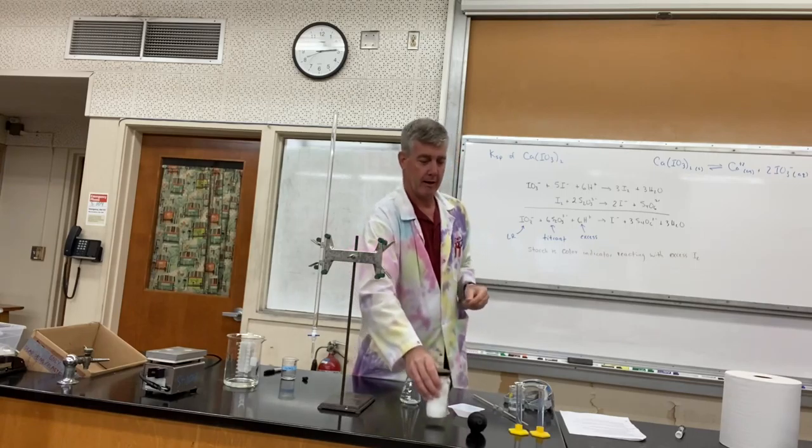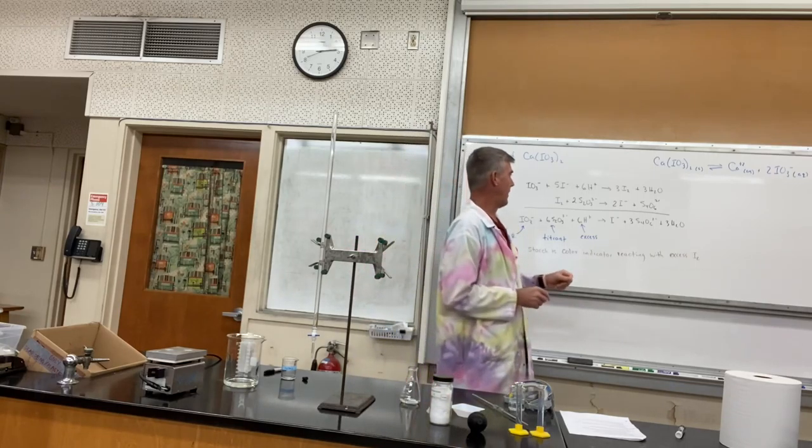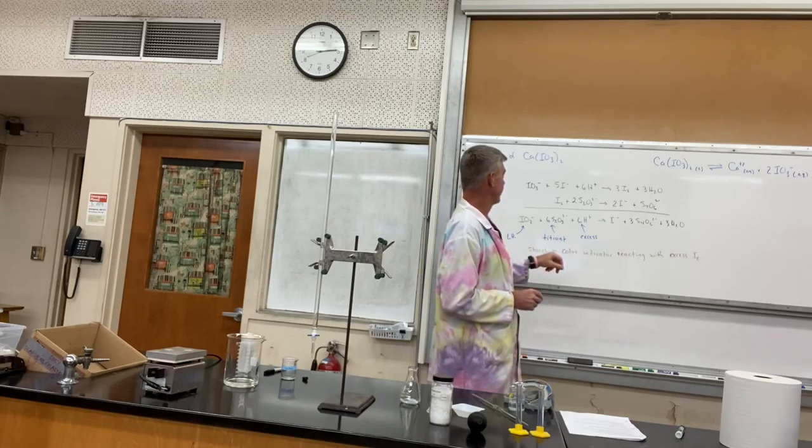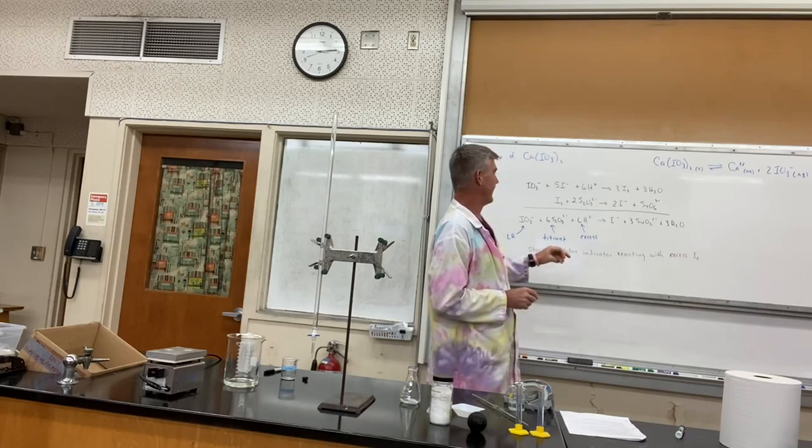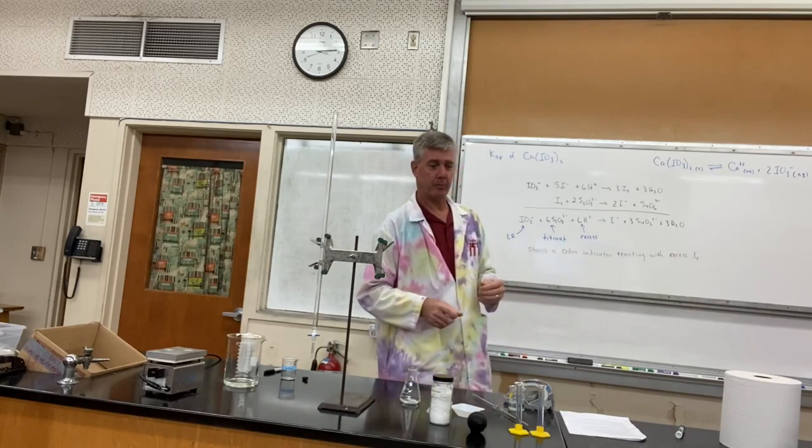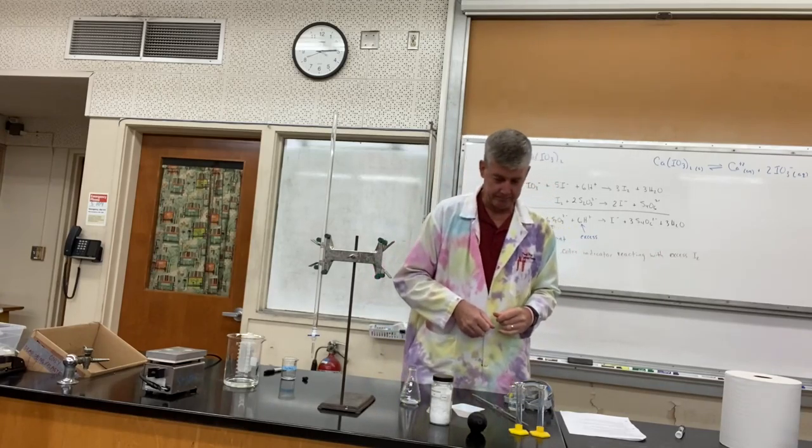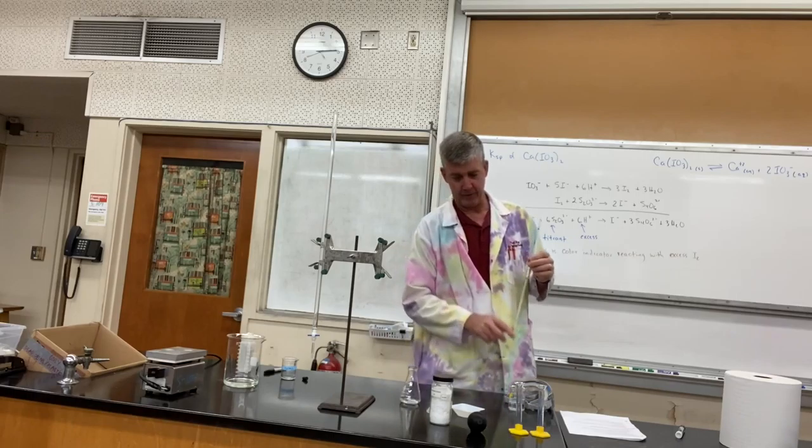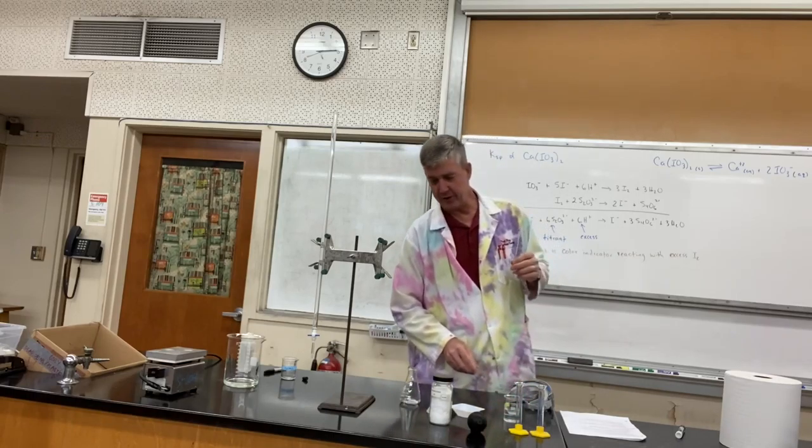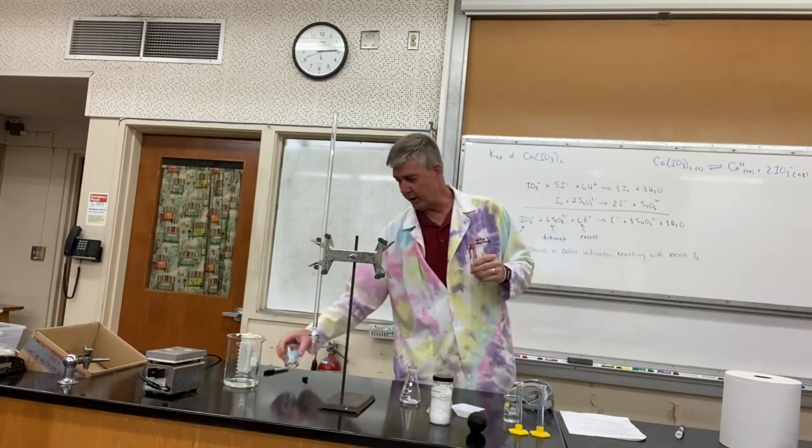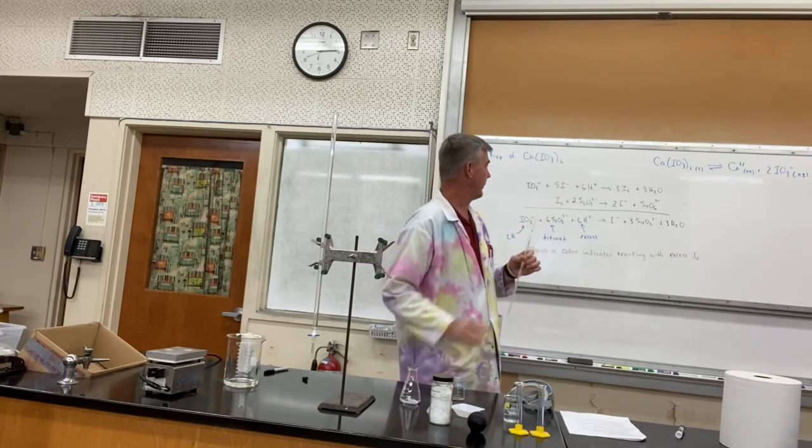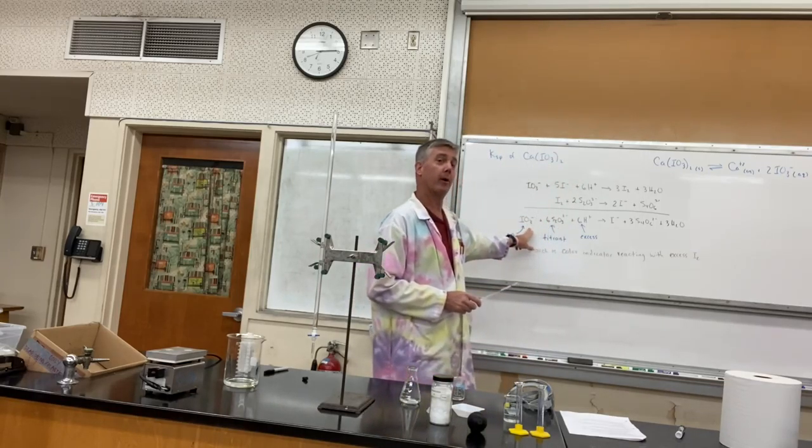We're going to add some acid, but that's going to be an excess reactant. So when it says to measure out 10 mils of it, it doesn't have to be perfect. I'm using a 10 mil graduated cylinder for that. We also want to add 5 mils of starch, which is going to be our color indicator. It's not part of the chemical reaction, so it does not need to be quantitative. About 5 mils is great.